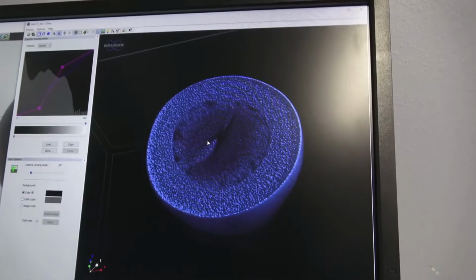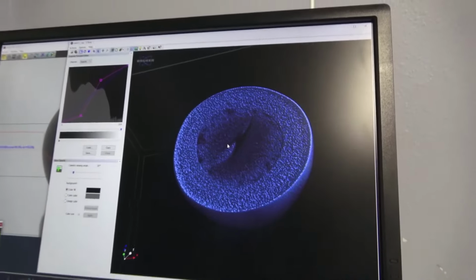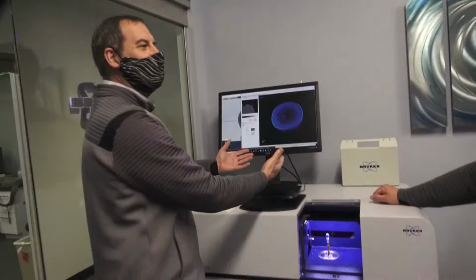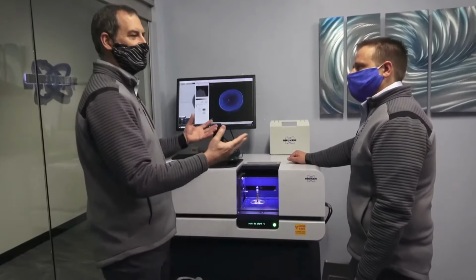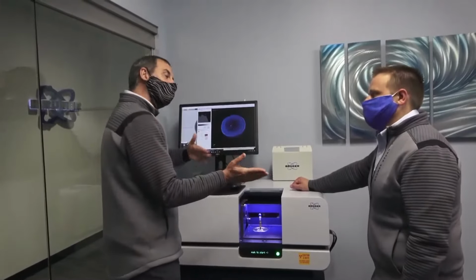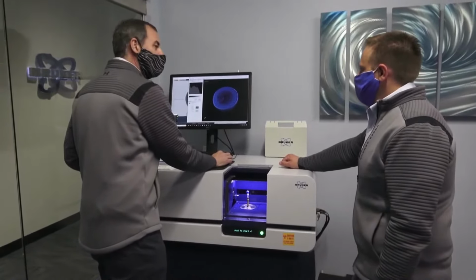And so, does the analysis stop here at these qualitative things, or can you? Absolutely not. If I wanted to do quality control on these, I wanted to look at the sample size, I could set up a program. I could run 500 of these, and I can do data analytics on the size, on the shape. What's the thickness? This goes back to the pharma question: if you're in pharma, you want to know exactly what the coating thickness is here.